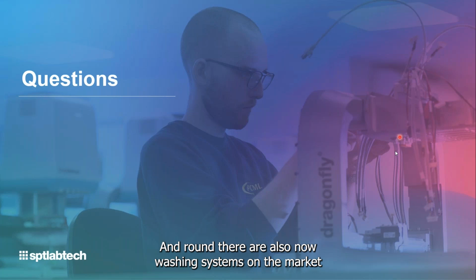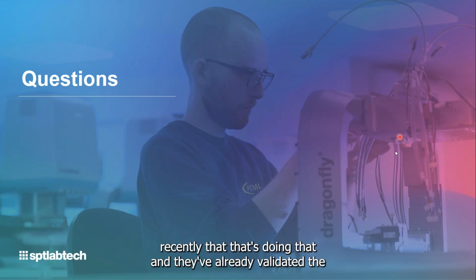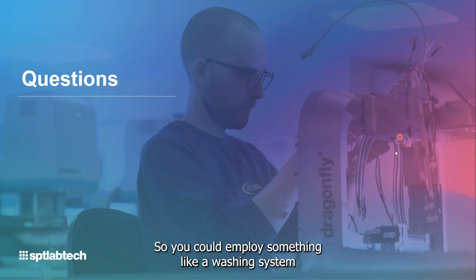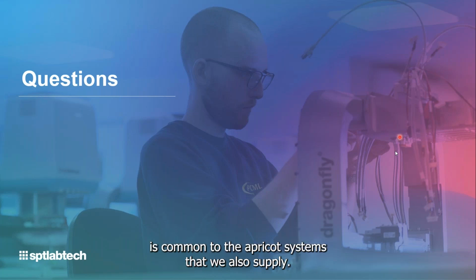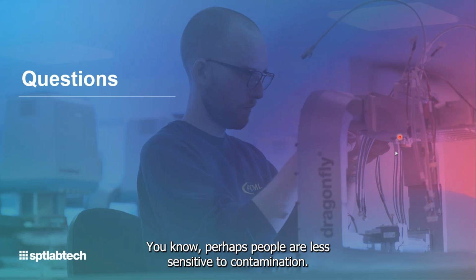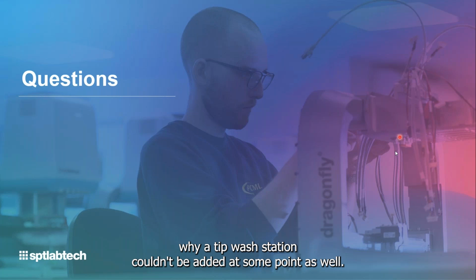There are also now tip washing systems on the market. We've been talking to one company recently that's doing that, and they've already validated the Firefly tips on that system. So you could employ something like a tip washing system. The pipetting head on the Firefly is common to the Apricot systems that we also supply, and on some of those systems they do employ tip wash stations, where perhaps people are a bit less sensitive to contamination. We haven't looked at that on Firefly yet, but there's no reason why a tip wash station couldn't be added at some point as well.